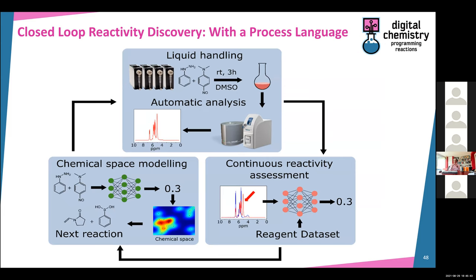So you've now got a situation whereby we are able to look at molecular complexity using assembly. We are able to analyze samples around the world and get some feeling for what molecules look like on Earth. We then went and built some robotics to do computation, to make complex molecules. Then we started to use the same hardware to make soup chemistry and then use machine learning to search for reactivity, but not just machine learning, to use assembly theory, which is more agnostic than machine learning, because with machine learning you have to train your system, and if you train it, then you have to introduce some bias.